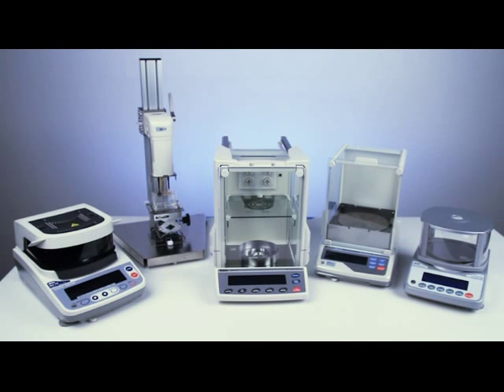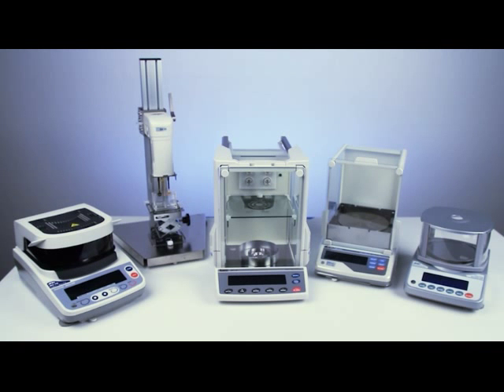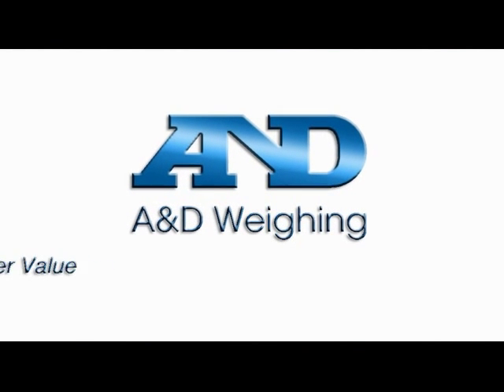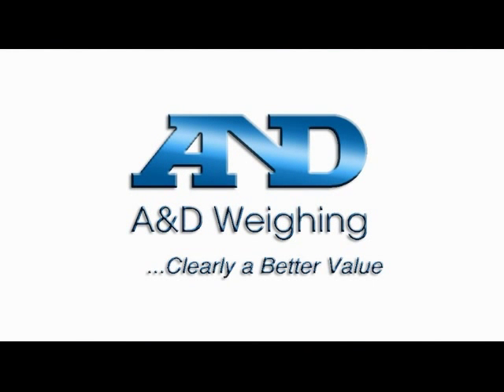Moisture analyzers, viscometers, laboratory balances and scales from A&D. A&D, clearly a better value.